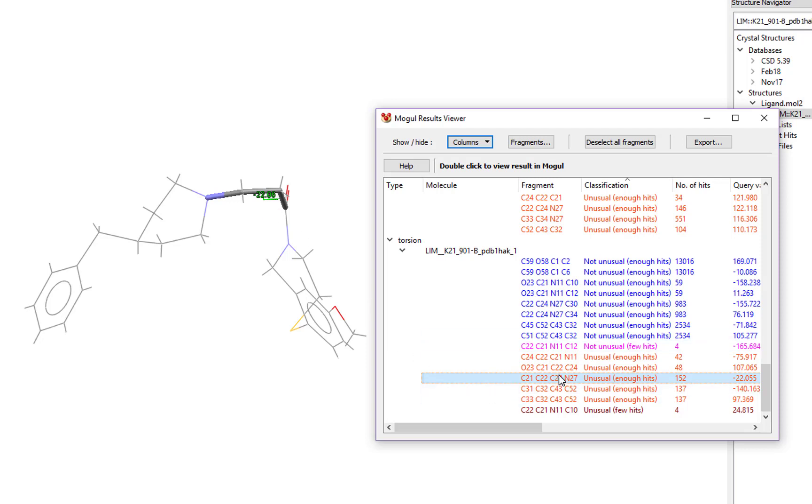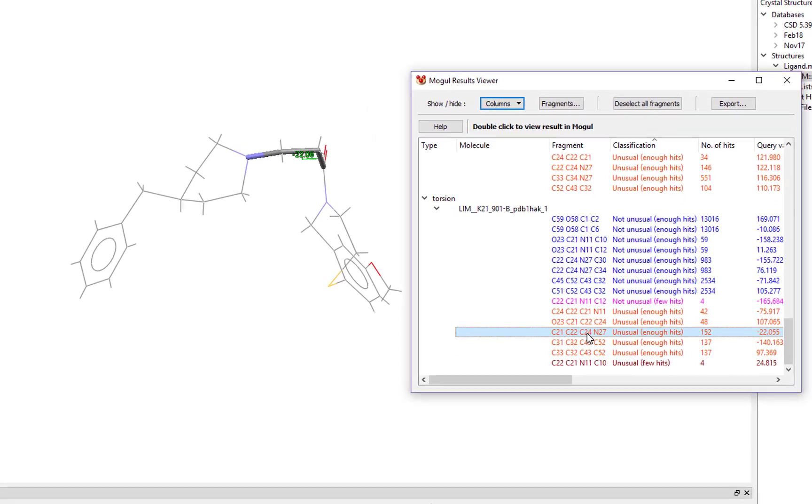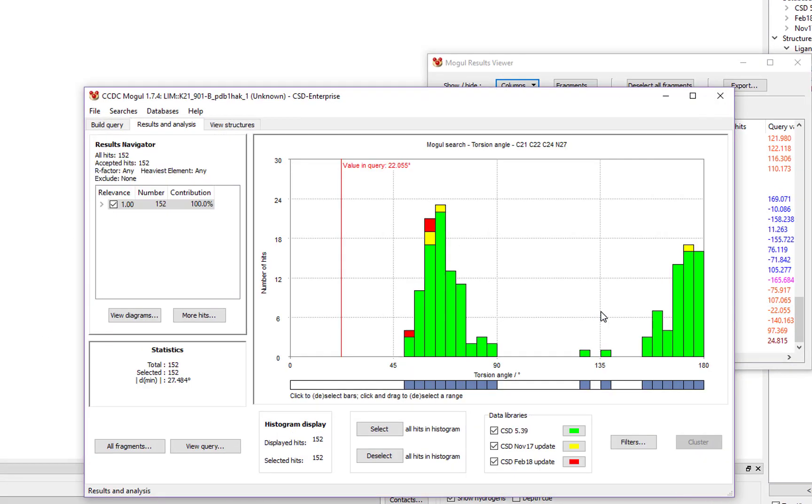To see how this compares to other representative structures in the CSD, double-click the line in the table. Now you'll see a histogram appears. This is a histogram of values of that torsion angle in similar molecules in the CSD.